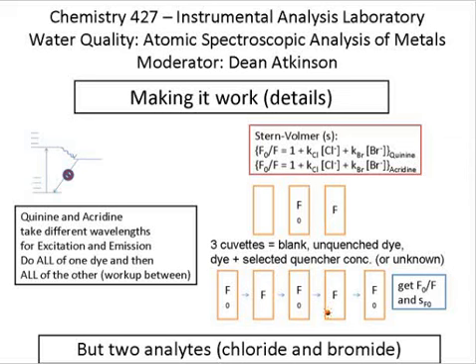And really the key to this is getting in. If you're the first group in the morning, get in, turn the instrument on, and let it warm up, because it takes about an hour for it to warm up to a good level where you'll actually get good data out of this instrument. If you're in the afternoon, quite likely the morning lab will have turned it on and you won't have to wait that long for it to warm up. Just make sure that as soon as you walk in the door for the lab, the lamp power supply is on and the lamp is warming up and the rest of the system is on. In other words, the cooling fan on the spectrometer is running, and the system is warming up and getting ready for you to do the experiments, or is already warmed up. Either way.